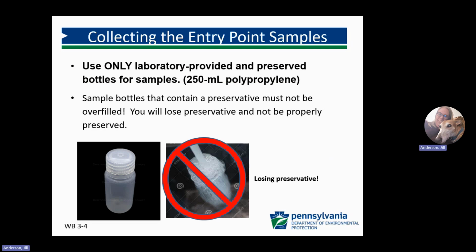Remember, your lab should give you specific instructions which you should be sure to follow. Use only laboratory-provided and preserved bottles for samples. This is very important because the bottles should be made of polypropylene and caps must be unlined. In other words, no Teflon-lined caps.